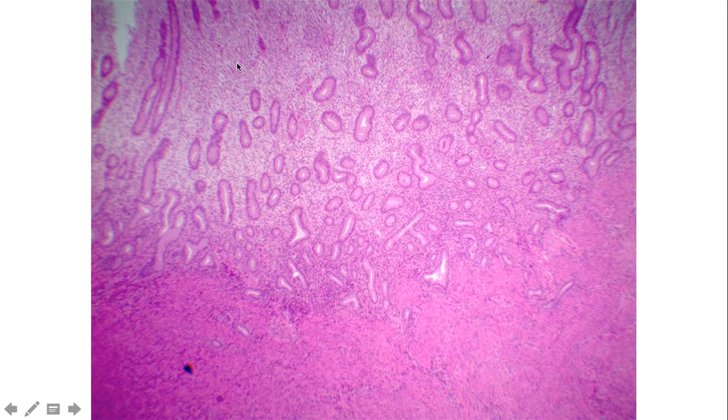Sorry, I take that back. It's the endometrium. Get a little ahead of myself. So the endometrium is this layer here that's going to be the mucosa. There's really no submucosa in the case of the uterus, and so the mucosa layer is referred to as the endometrium. And you'll notice in here that there are a lot of glands. So these are these uterine glands that are going to be present throughout the endometrium.